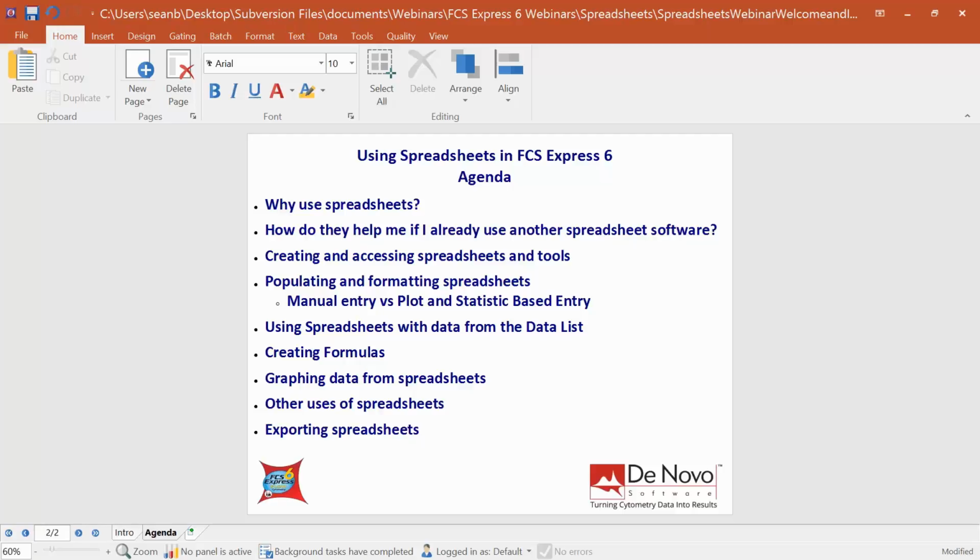So up on the screen here we have a little agenda of what we're going to try and cover today, what we're going to try and teach you how to use in FCS Express. And the first two items here are about why you would want to use FCS Express and why you would want to use spreadsheets in there.